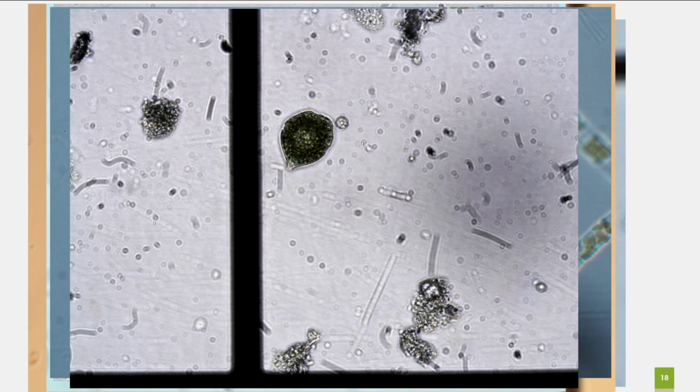Yeah. And then with the Pseudo-nitzschia ones, now we're discovering there's not just domoic acid, which is its toxin, but there's another compound that's screwing around with the tests. It's a crazy thing to get into. So, I don't know if I answered your question. Basically when we get results, it just tells us that the toxin's in the water, and we relate it to the Alexandrium genus. Like Chris said, catenella is the most common species, I think, but with a light microscope it's nearly impossible to identify the species, especially with Pseudo-nitzschia. We did not identify the species with that.